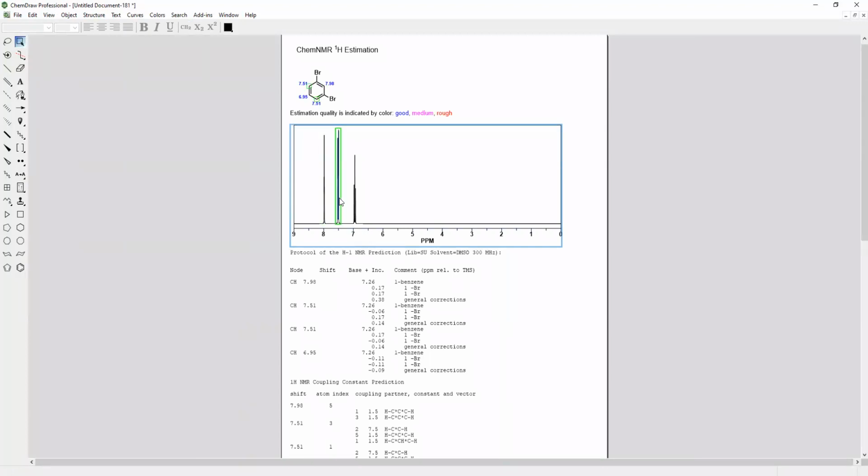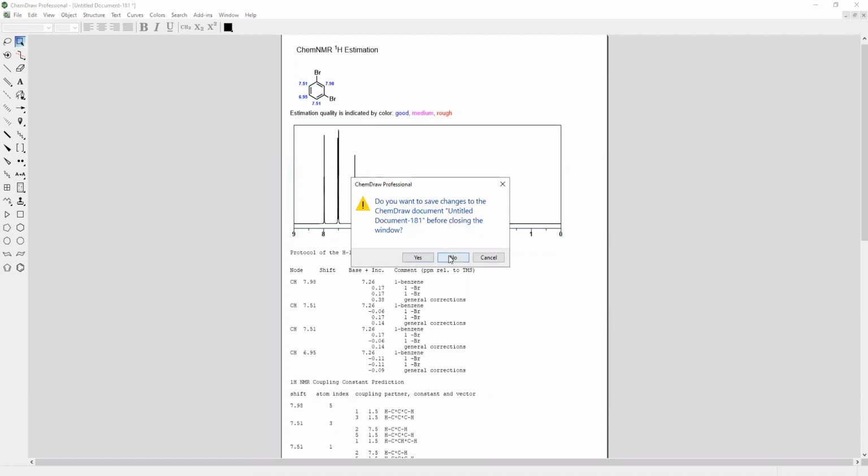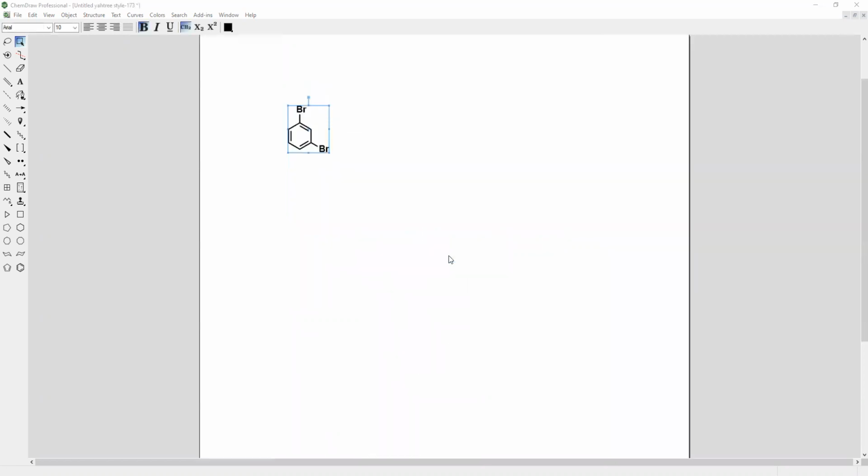Oh, okay. So it's like a singlet, and then you have a 2H and a 1H. So you'd have the singlet you'd expect, then a 2H, and then a 1H. So 1, 2, 1. It's the only way that this would work. It's not a pattern that we usually see, but it still follows the meta pattern, in that there's a single singlet. So you could still figure this one out. Okay, cool. So hopefully, fingers crossed, you don't get something weird like that.